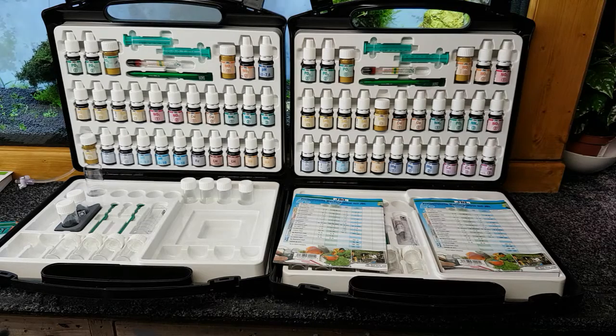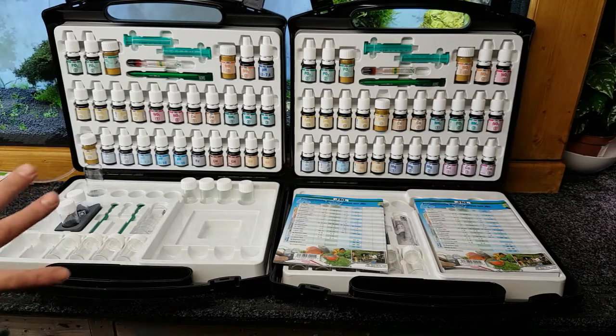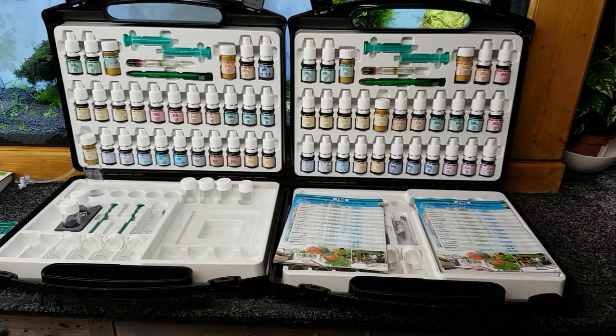Right then, I think what we should do first is an ammonia test. So I'll clear these away. Like I said, guys, ammonia first, and then we'll go on to nitrite and nitrate.